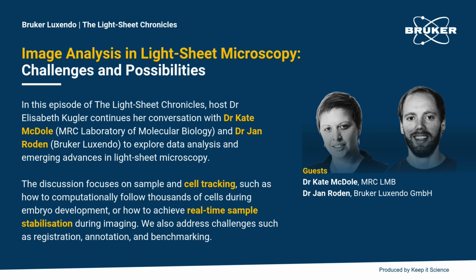Yeah, exactly. So this is a much less sophisticated type of tracking than what Kate does, which sounds awesome, by the way. We track more like the whole sample, so that when it starts drifting out of the field of view, the stage automatically brings it back into the middle of the field of view.